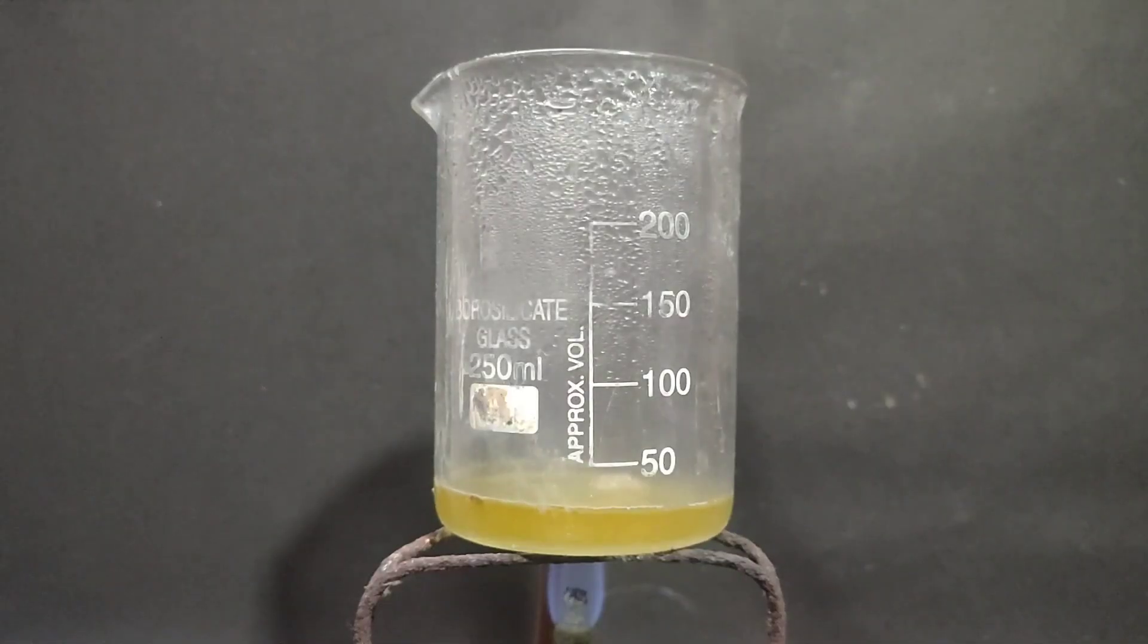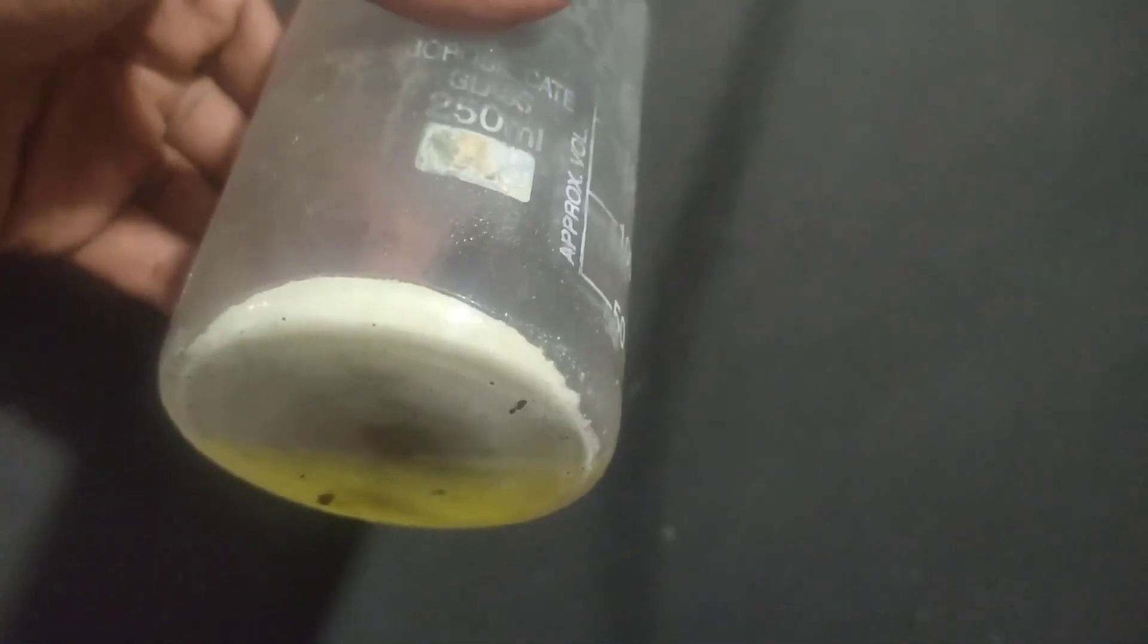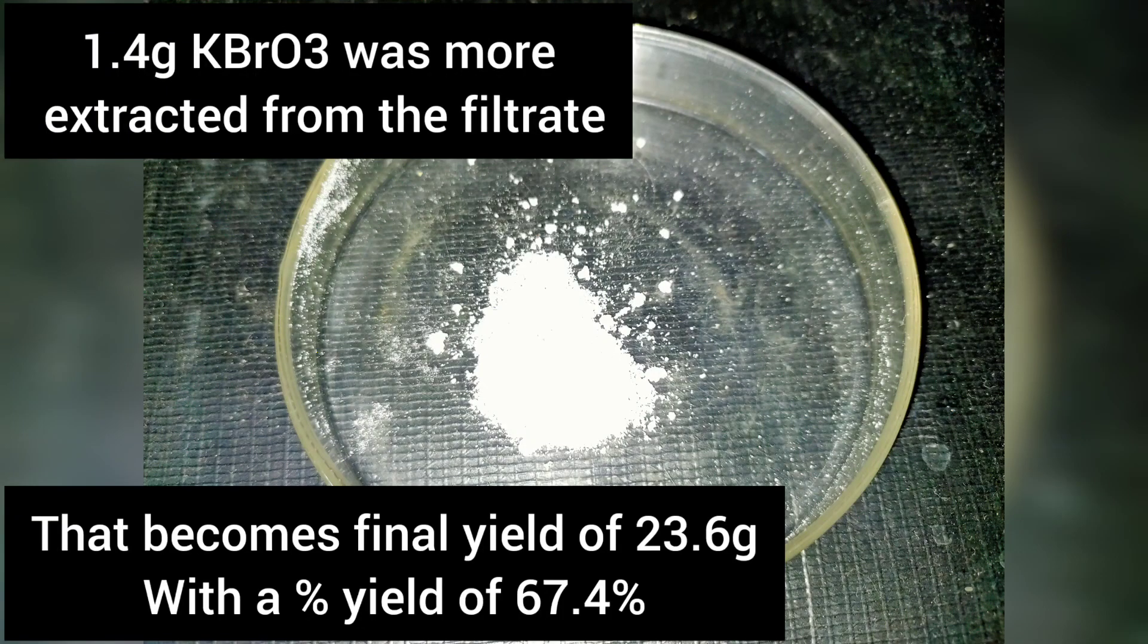Then I took the filtrate and concentrated it from around 100 ml to 25 ml. And on cooling, some small amount of crystals were formed inside the beaker. I also filtered them using vacuum filtration and dried them in a desiccator. And this yield came around to be 1.4 gram.